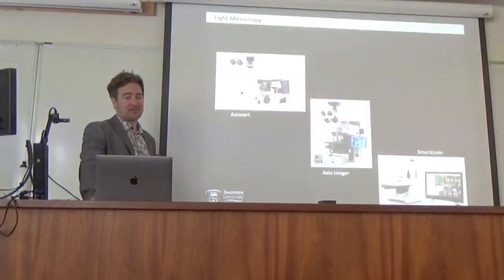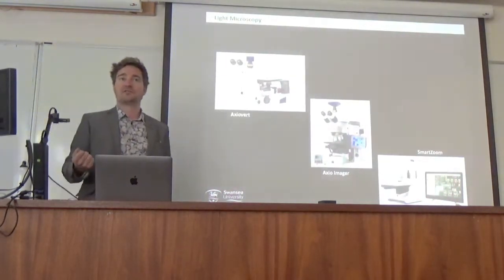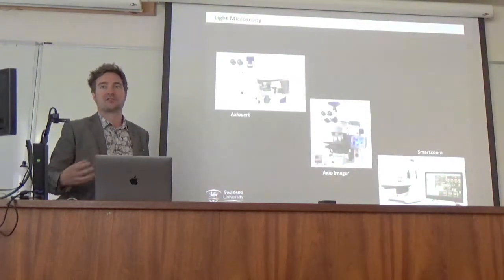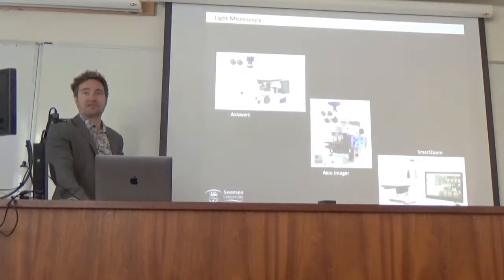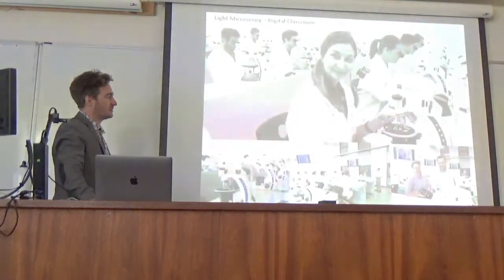The next things we're going to go through really quickly. So the message from all of these is that we can generate data. That's all we do, data in different forms, and then it's how we deal with that. And we have to reach out and look at different software solutions to be able to deal with the data in different forms. So light microscopy, there's many different forms of light microscopy, different machines, different file types, where we try and standardize across those and use software that can deal with them all.